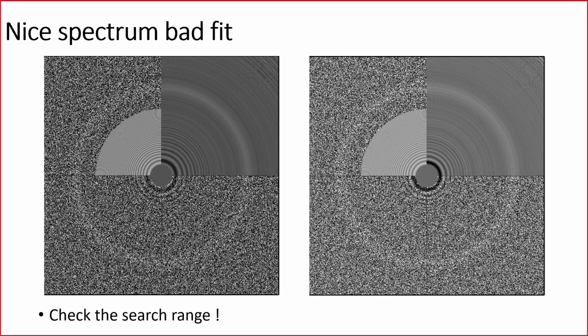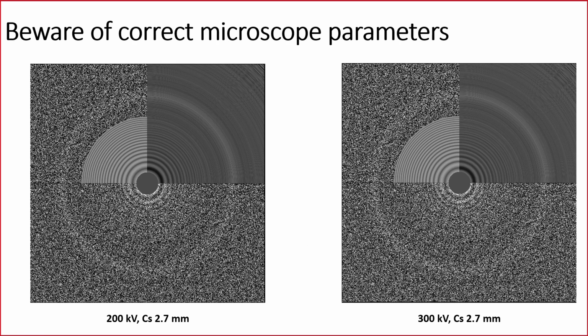Rather, we know that our data was acquired from the focus -1 to the focus -3. Sometimes it happens that there's a larger offset in the microscope, and then you will have even micrographs with the focus of -0.7, and they would be out of our range. Therefore, if you see images like this, when you've done your CTF estimation, check the search range and rerun the CTF estimation process.